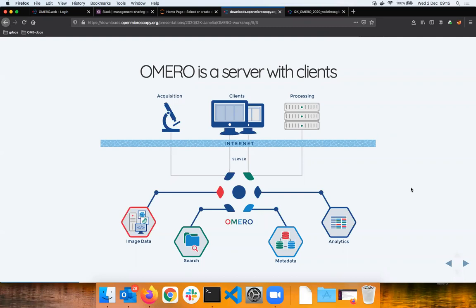So the access to the server is facilitated from your local machine, your desktop or laptop, which you are sitting in front of right now. And it has a connection to internet, in OMERO's case, definitely. And on your laptop or desktop, there is running an application which is capable of connecting to that server. And the application, the local application, that's what we call client. That's all there is to it. So I will use the word client in a phase that you understood what I'm saying.